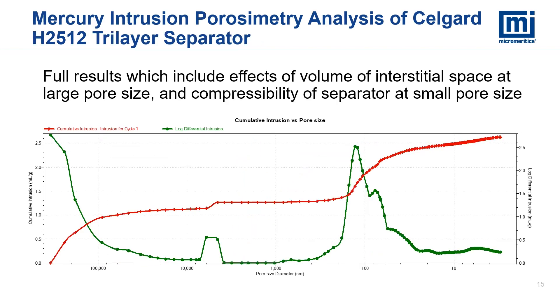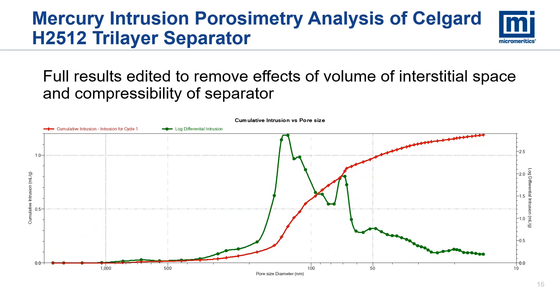This graph includes the cumulative pore volume distribution in red and log differential distribution in green for the H2512 tri-layer separator. Again, the modes to the left are due to interstitial filling and the small one to the right is due to compression, and again we can use the features of the AutoPore software to remove these effects. In the edited graph we see that this separator has a primary mode in the distribution, again skewed toward the small diameter side, but also shows a second mode on that skewed side. Note this is a tri-layer separator, not a monolayer one like the last sample.